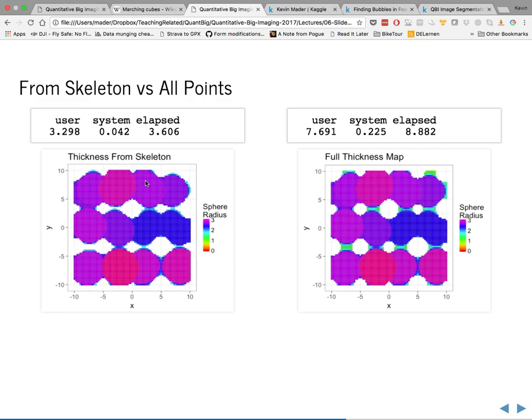And so if you were looking at what's the radius of this bubble, it would still be correct because this radius was calculated from the largest sphere that fit inside. You're not actually subtracting any volume when you mark this with a larger radius.